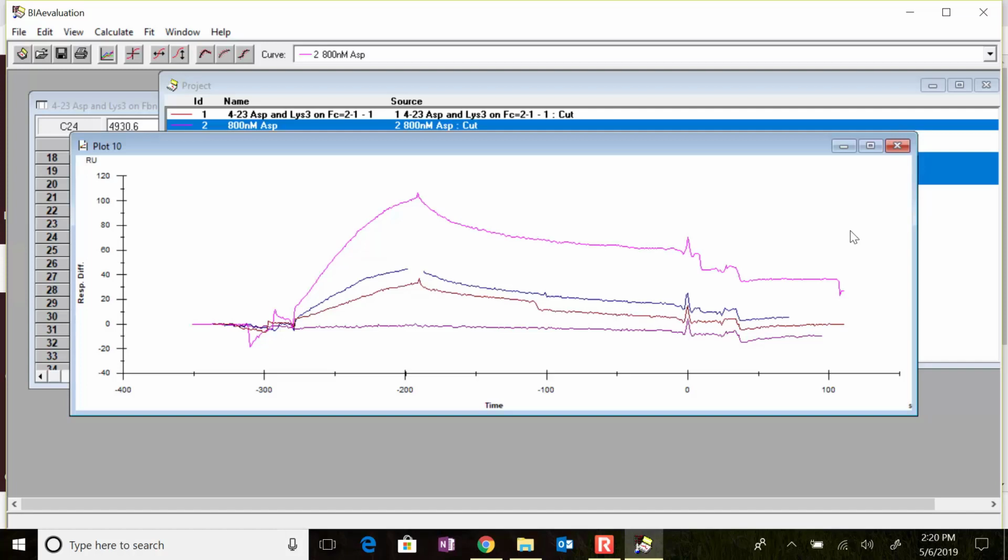Now we want to line it up, and we want to find the X baseline because it's not lined up in the Y direction yet. So now what I'll do is I'm going to do the next one over. I'm going to do the Y transform. But before I do the Y transform, I want to actually right-click select again. Remember that right-clicking is going to be selecting. And I want to select the real narrow band.